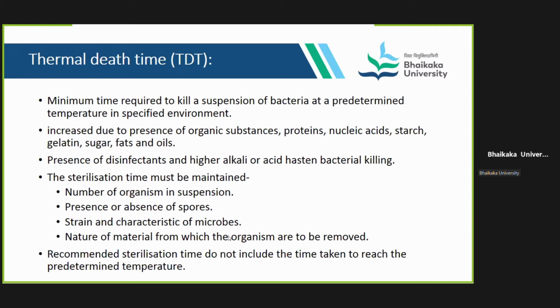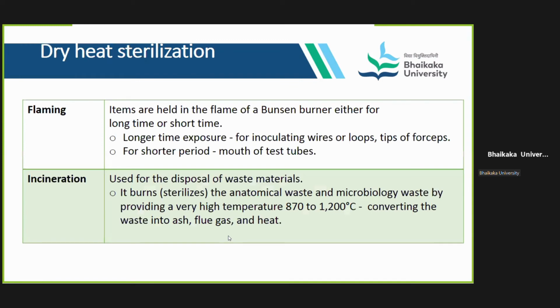And remember, this time is counted after that particular temperature or the condition of sterilization has been achieved. Once you raise the temperature to, for example, hot air oven needs 160 degrees Celsius, the time taken to reach 160 degrees Celsius is not going to be counted in your death time. It is after the temperature has been achieved. You have to ensure that the hot air oven runs for 1 hour or 2 hours, whatever is the time that has to be ensured, right? So keep this concept in mind.